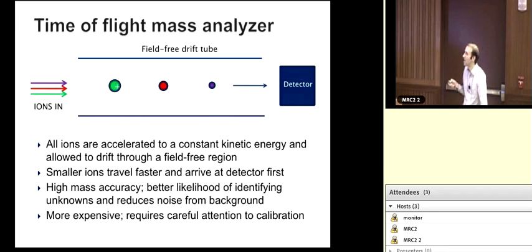So those are generally not ideal to have included. Again, there's ways around this, but just something you should be aware of. Other analytes present at higher concentration. This is one that's trickier because you can't just remove it from your sample prep procedure. You have to be able to manage it.